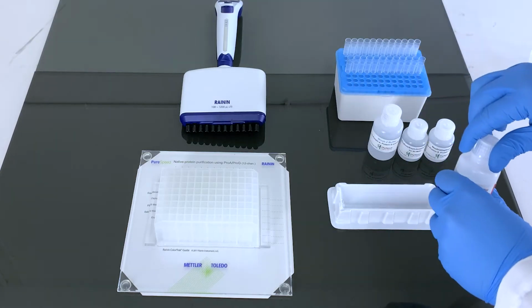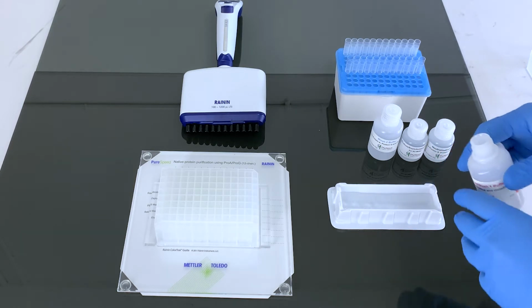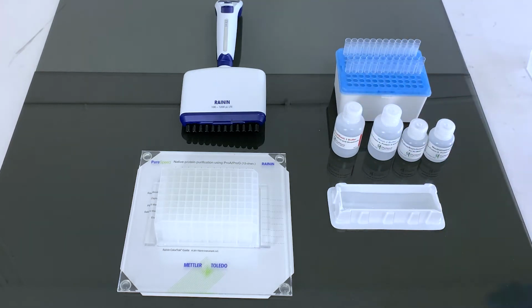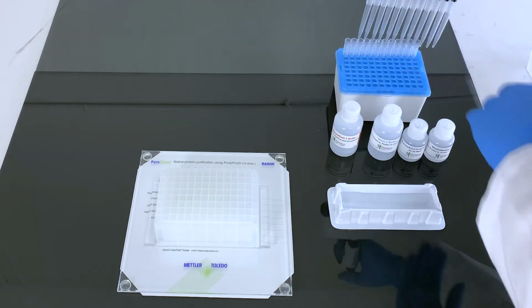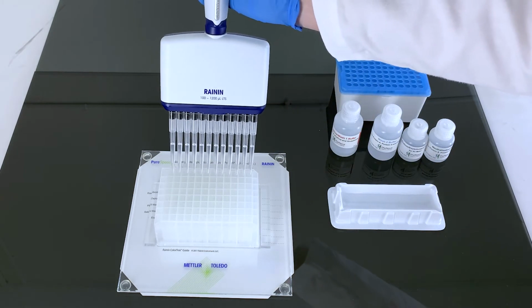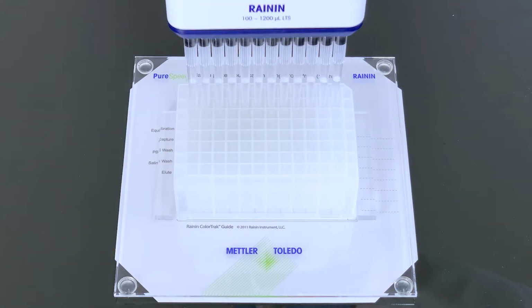Prepare the included PhyNexus buffers for your prep. For Pro A and Pro G, a neutralization buffer is needed. Add the appropriate buffers to each row. See the manual for the needed buffer volumes. Continue preparing and aliquoting buffers to the other rows.